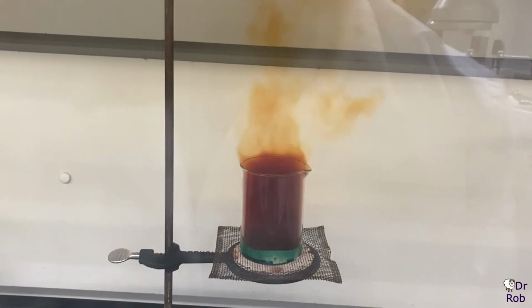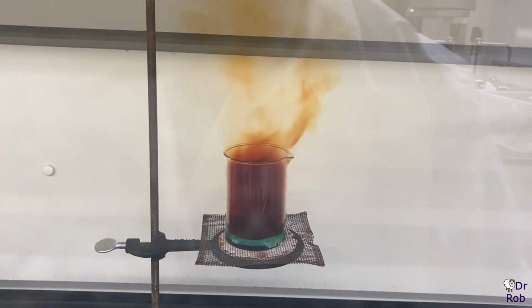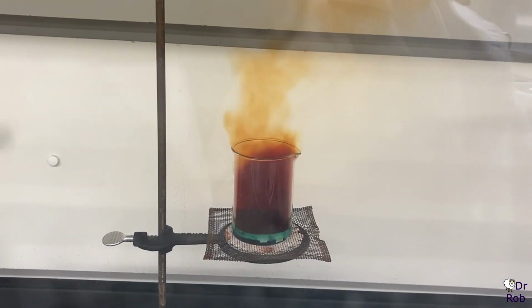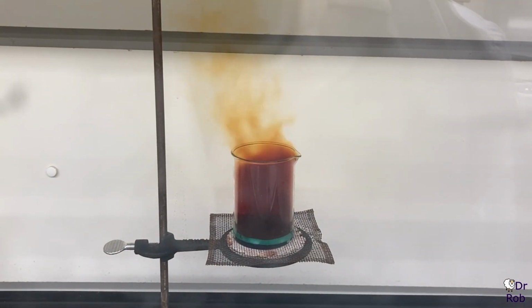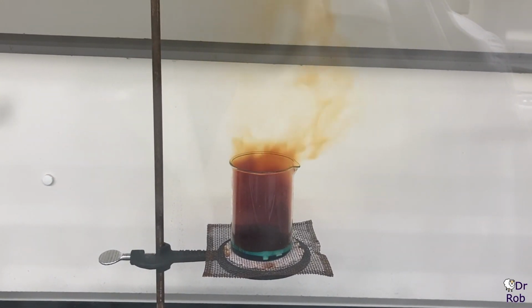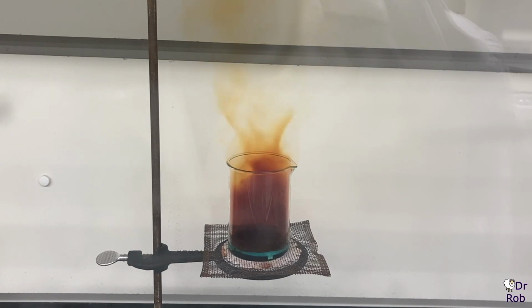Normally we think of copper solutions as being blue when they're in water, although this one's green because of the nitrates. Because the acid is so concentrated, there's so many nitrates floating around that the copper is going to be coordinated, or basically surrounded, by the nitrates, giving it a green color. If you dilute this solution, as you do in later steps in the course of the experiment, it turns more of the blue that we're more used to seeing, as those nitrates are displaced by the water molecules.